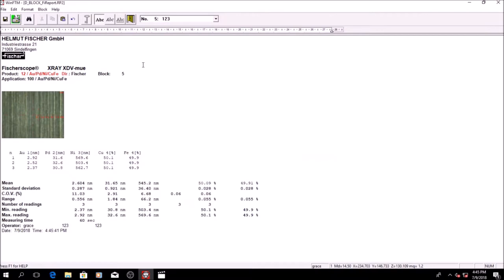Finally, I would like to create a report with the results I have. The report features measurement values and statistical information. Each block can be selected and printed. The report can be edited and a template can be customized if required.